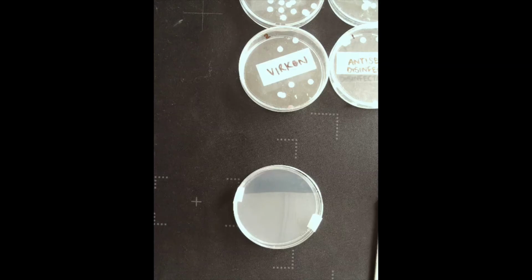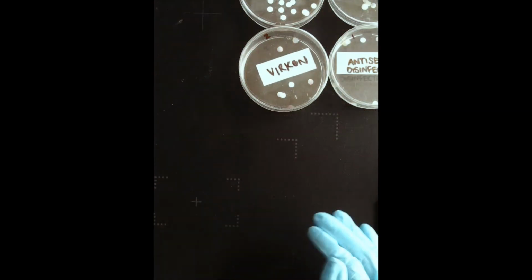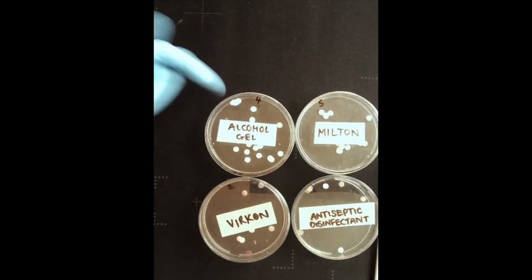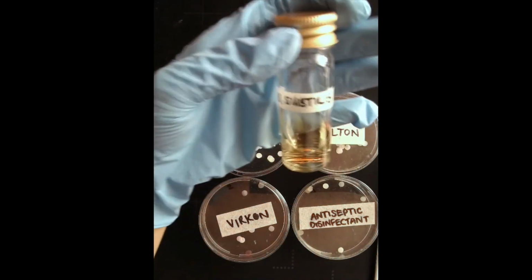Now I'm going to investigate the effect of different antiseptics on bacterial growth. So here's my Petri dish from before that I'm going to use. And here are the 4 different antiseptics that I'm also going to use. So I've got alcohol gel, Milton, Virkon, and antiseptic disinfectant. The bacteria that I'm going to use is B. subtilis.